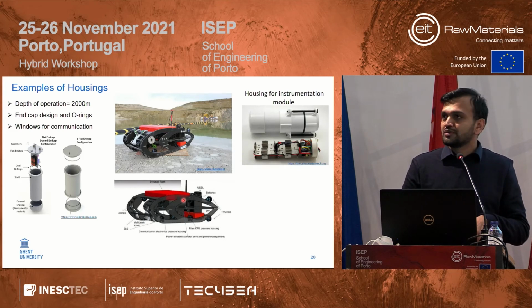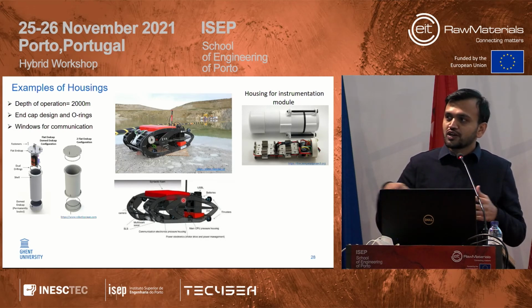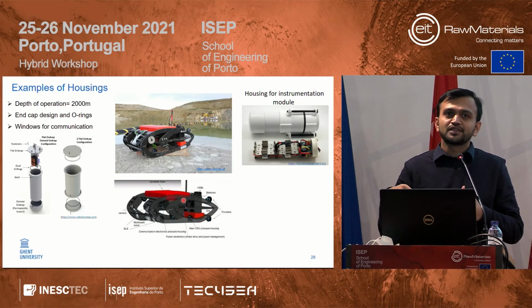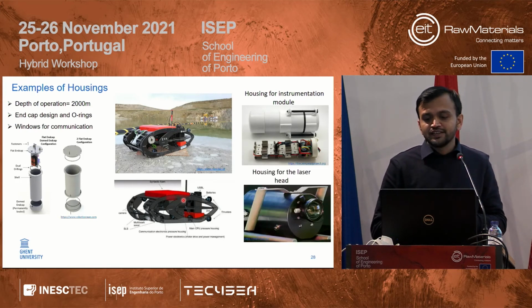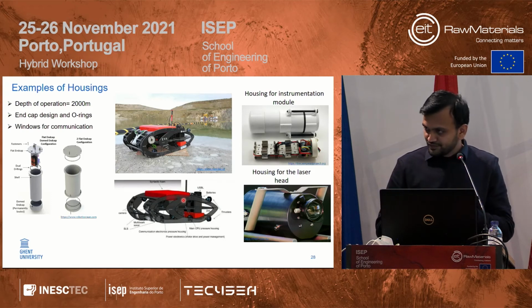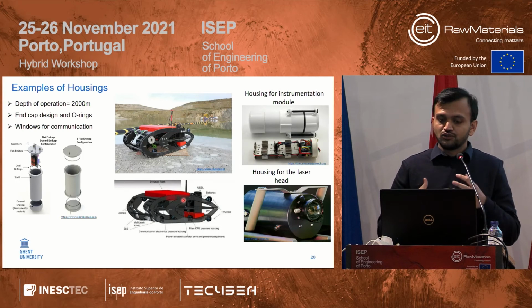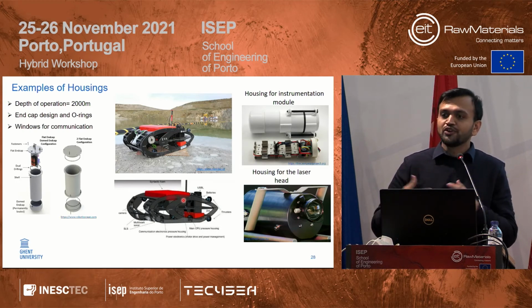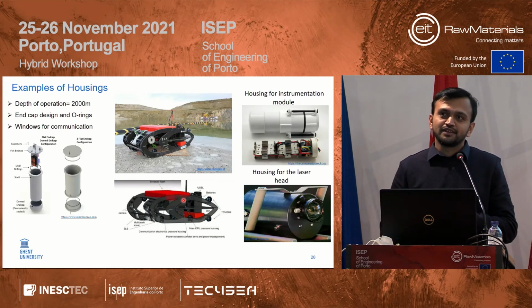For housing instrumentation, it need not be domed; a flat end cap is required just to connect or plug our optic fibers into the housing. For housing the laser head, where we are going to fix a camera to capture images or fix a laser head to communicate with the materials, in this case, one end is required to be transparent.